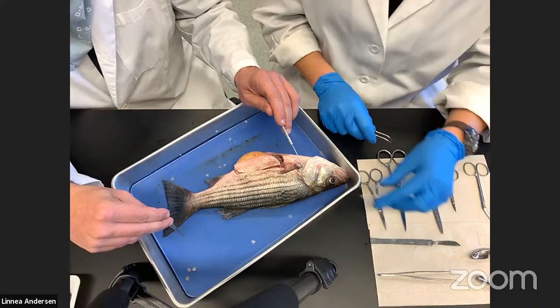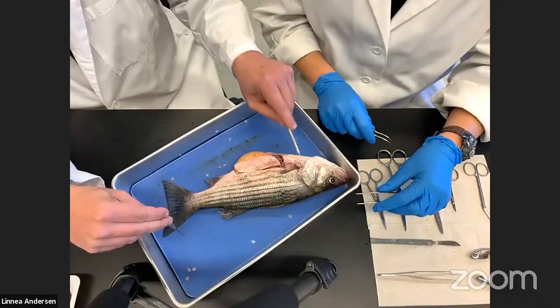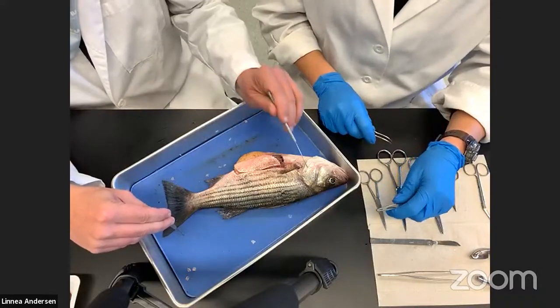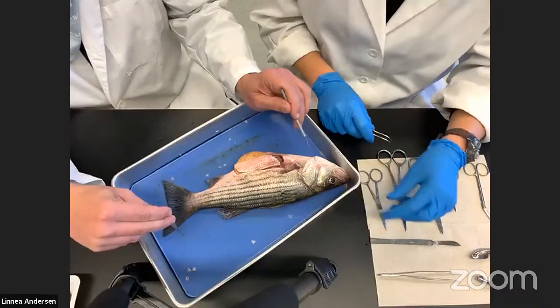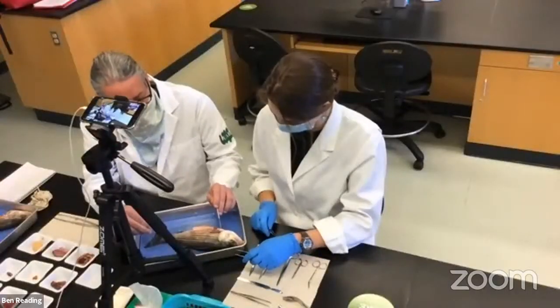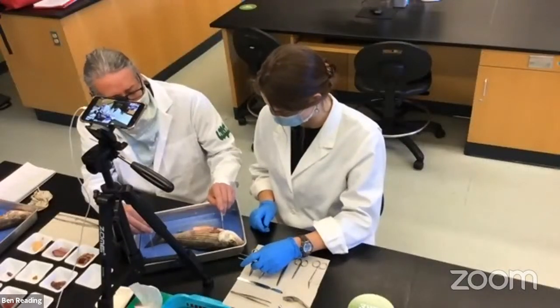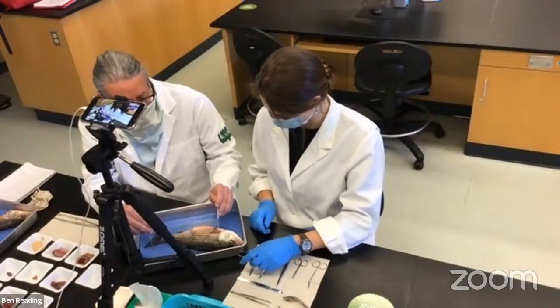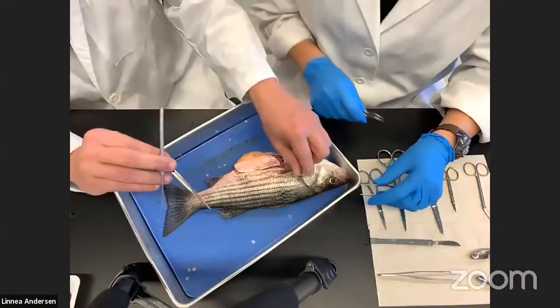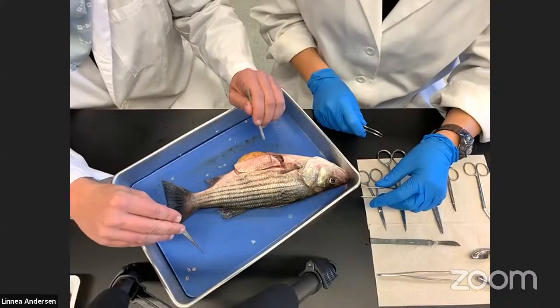Another feature of the striped bass: if we tap this hard bony plate, you can hear that it's hard bone. This is called the operculum. Underneath here are the gills — very delicate structures involved in gas exchange — and this bony plate provides armor to protect them. In the case of a striped bass, there's a sharp spine here on the operculum that can cut you if you're handling these fish. That's another feature specific to the striped bass.